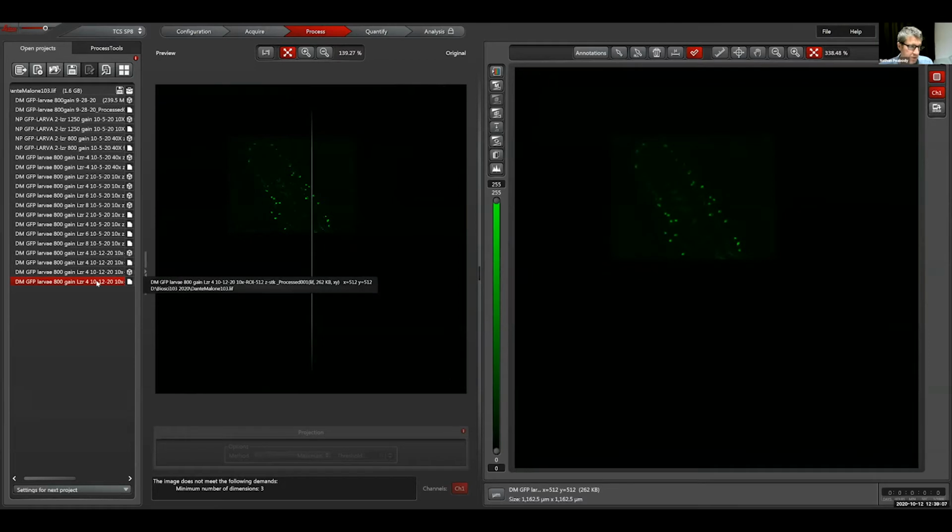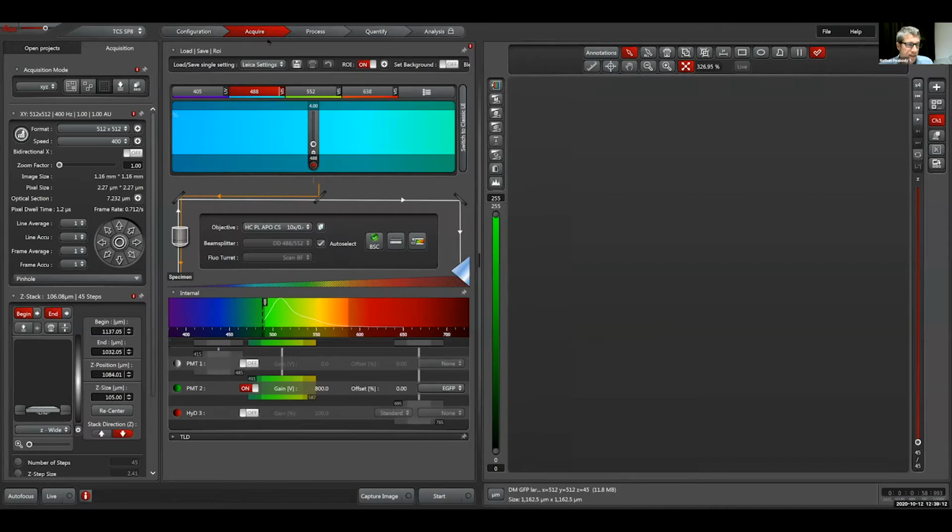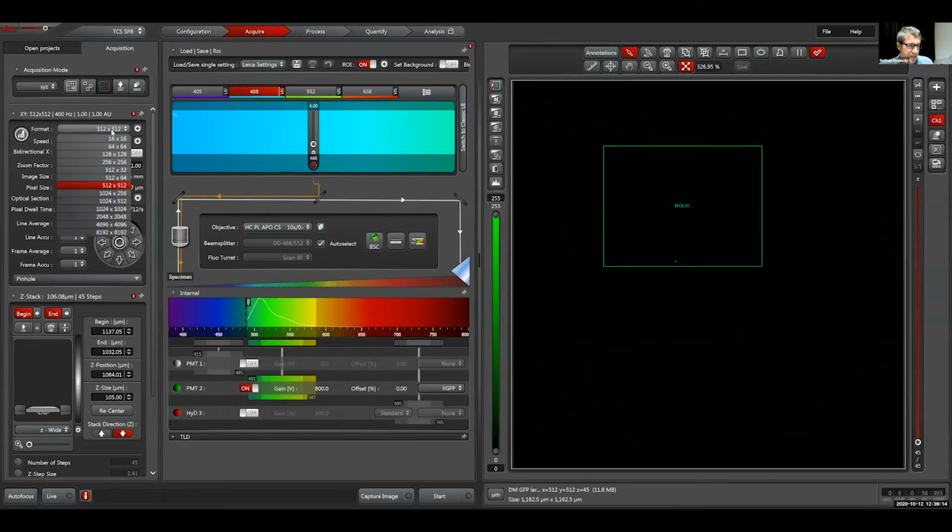Now, that was with 512. Now we're going to go back to acquire. And we're going to do the same exact thing, except I'm going to make this. That was a tester. You already have a 2048 by 2048. It's a bigger picture, but you already have the same thing. Okay. We don't need the same exact thing. So I'm going to go up to 4096. Okay. And now it's going to do this region of interest in 4096 by 4096.